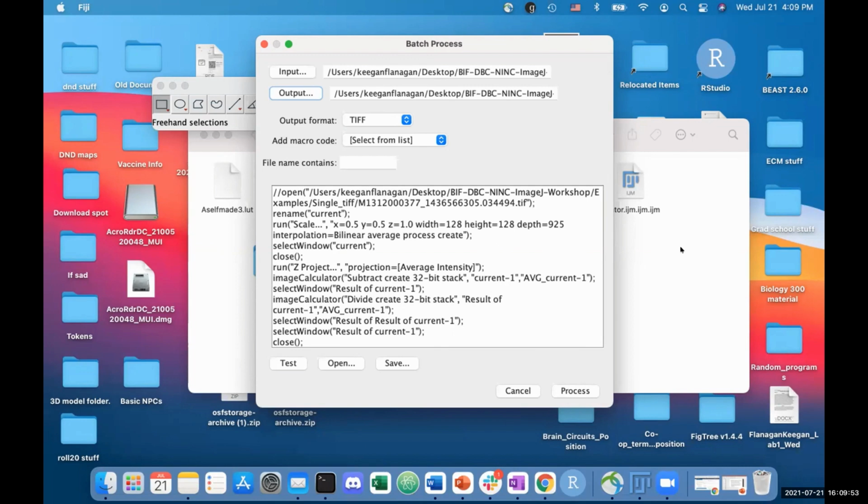So then I wasn't sure what I was supposed to do there, because previously I closed all 3 images and so I don't know which image I'm using for the brightness and adjust contrast.